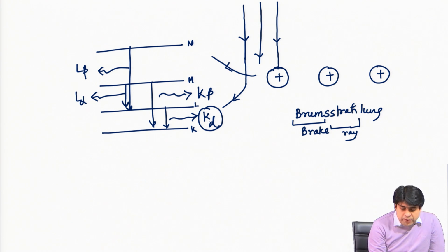That is why K alpha is higher than L alpha.